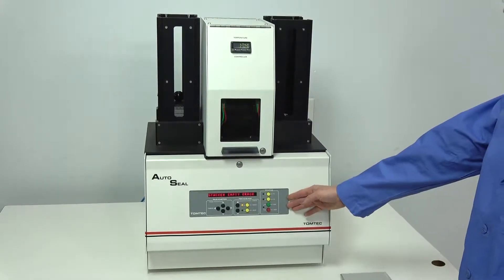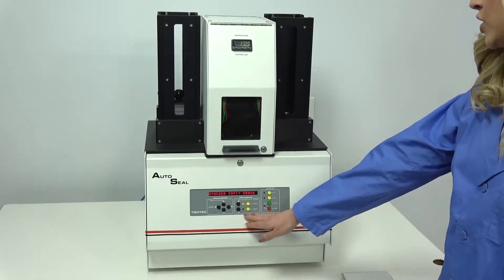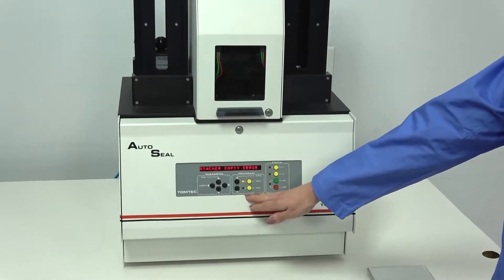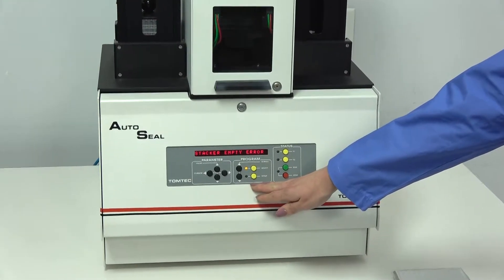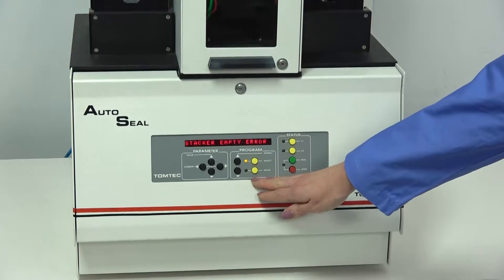The program here on the front will allow you to select which program. It will hold up to 12 programs and you can fully customize them.